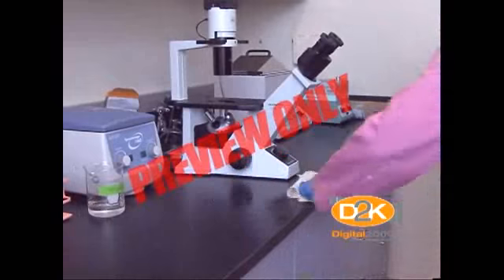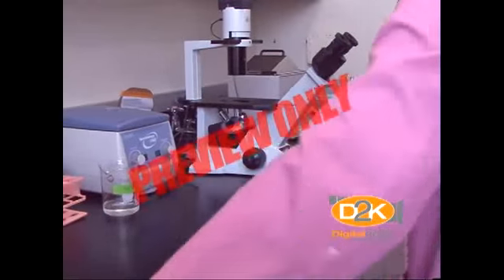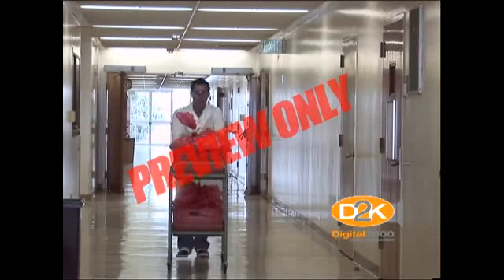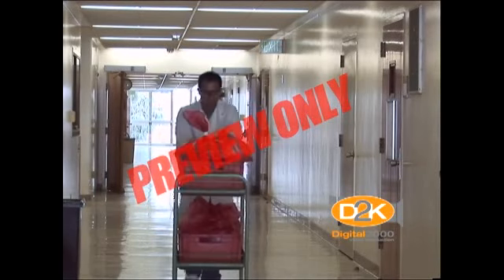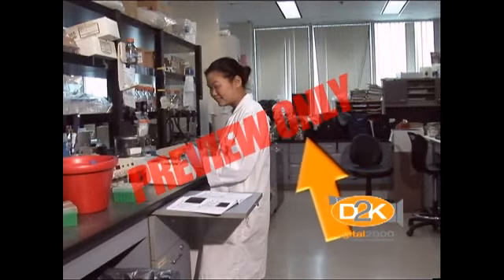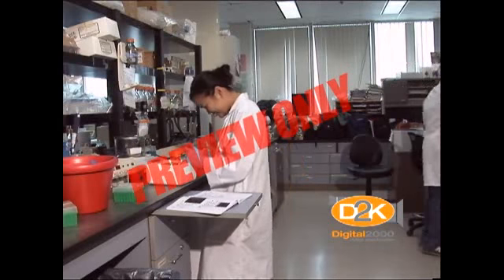Contaminated equipment and work surfaces must be decontaminated daily and decontaminated immediately after any spill. Contaminated materials must be transported in leak-proof containers, and miscellaneous materials such as books, journals, notebooks, and personal items must be kept away from contaminated areas.